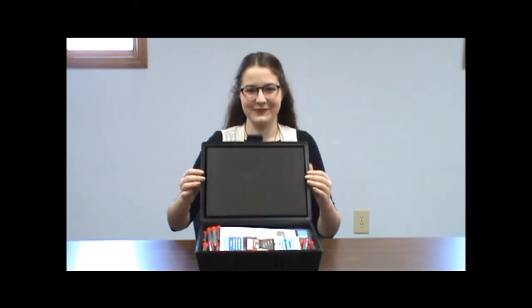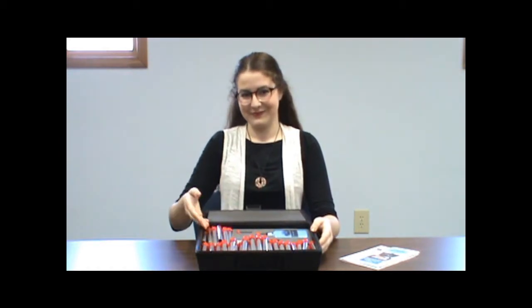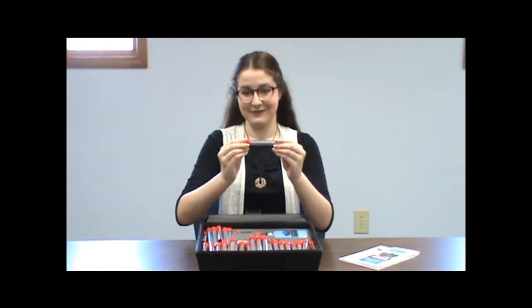Hello, I'm Michael and this is Kirstie and we're here to tell you about the 30th anniversary edition of our asbestos bulk sampler. Inside the sturdy carrying case is the requisite paperwork, but the heart of the system is a hundred cutter sleeves that are in a plastic vial with an airtight cap.